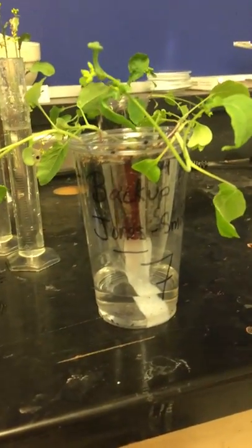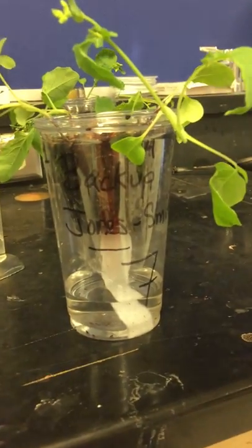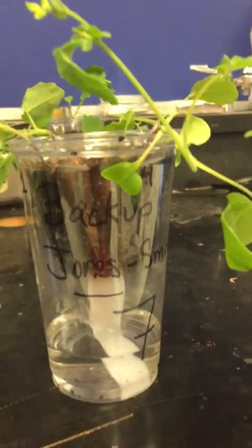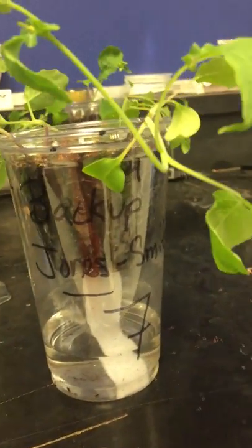So, refilling water on your growing system. We haven't been back in class for a while and your water level may have dropped considerably. This one has a little left, but some of my other ones are actually empty, so we want to make sure that we get this filled back up with water.